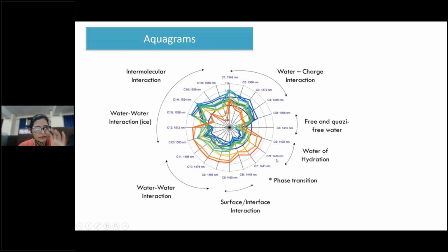Now the hydrogen bonding is a bit stronger. In this region, here it goes the phase transition: vapor, water vapors, and then water. So now water is in the stage which you normally look. But from this range, if you go higher towards 1500, it is going towards strongly bound structure. So water-water interactions are increasing and it is becoming, you can say, something like ice, strongly bound. And on the upper side, till 1555 or so, you have water-water strong interaction. It means water is now behaving as ice.